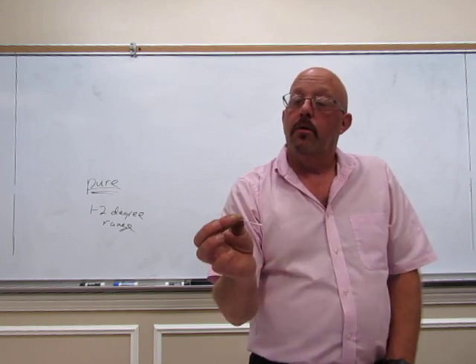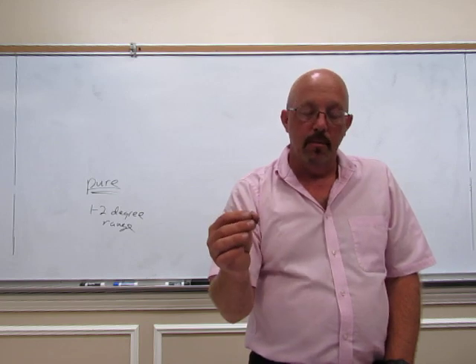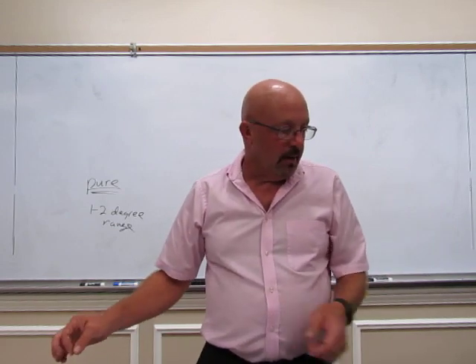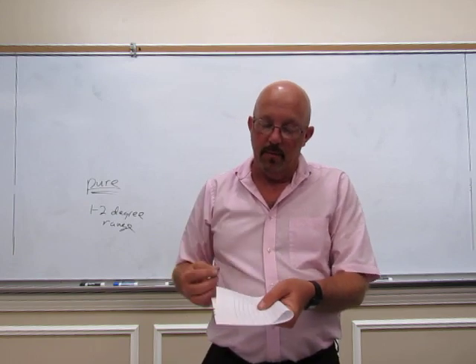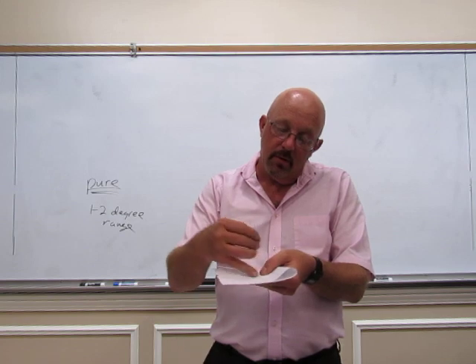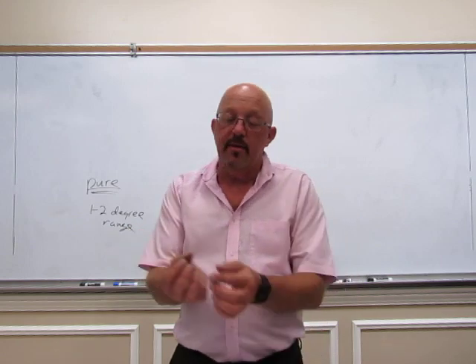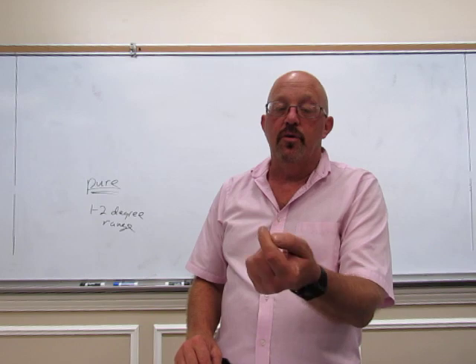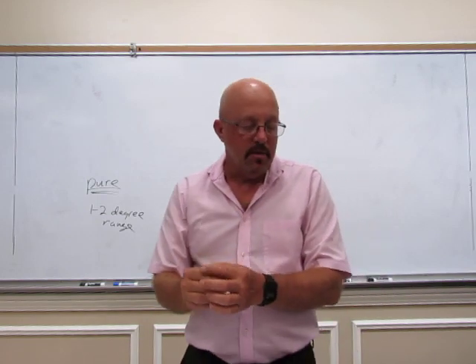So to take the melting point, you've got to get your sample inside of the capillary tube. So take the open end. I didn't bring any compound in here, but let's say there's some compound on this paper. Just take the open end and press it into your sample that's there. Just get a little bit in the tip. Just need a little bit in that open end. As long as you can see it, that's enough. Don't fill the tube up. You just need a little small amount.